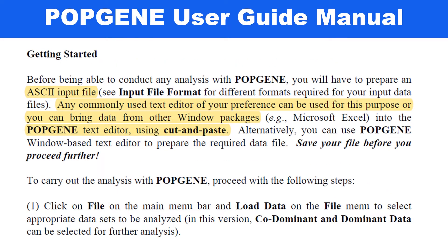For getting started, Popgene accepts the ASCII input file format. If you have Excel or another text editor, you can easily create an ASCII input file, or you can use Popgene's built-in text editor. Just copy and paste data from Excel into the Popgene text editor and save your data sheet with a specific ID such as dominant, co-dominant, diploid, or haploid. Then click on the File main menu bar, load your data file, and select the appropriate data type you want to analyze.